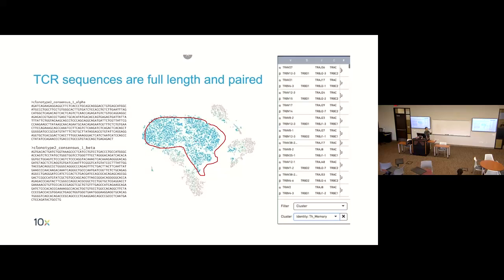So if you have unstimulated samples, all the T cells may be in their natural states. There's no particular clonotype that is amplified, so you see all different kinds of receptors. But in your sample, if you have something like this, 70 to 80% of the T cells sharing the same receptors, you know they start from the same cell and get amplified because this particular condition requires a T cell to generate a lot of those stimuli.